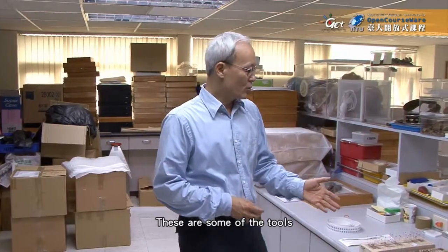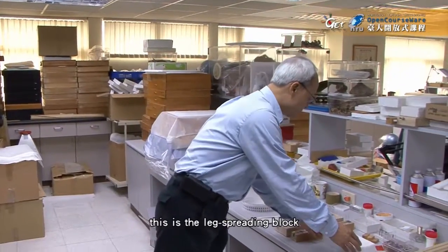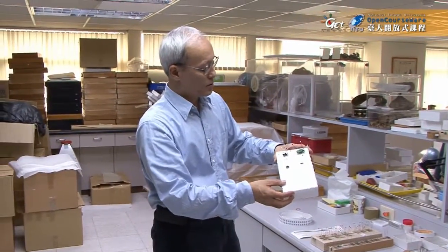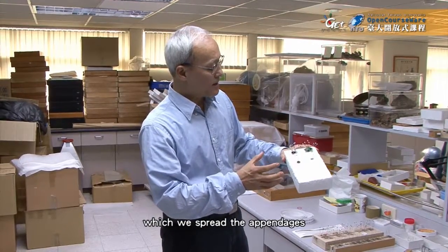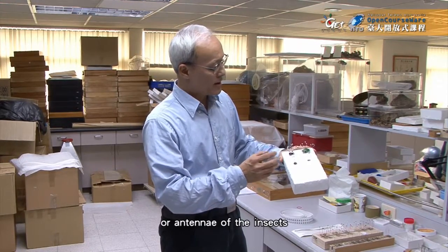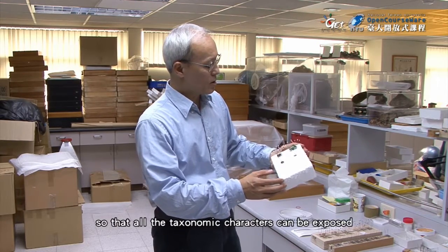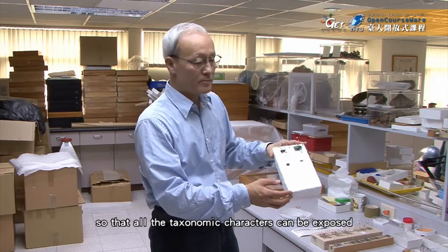These are some of the tools we use to prepare our specimens. For example, this is the leg spreading block, with which we spread the appendages or legs or antennae of the insects so that all the taxonomic characters can be exposed.